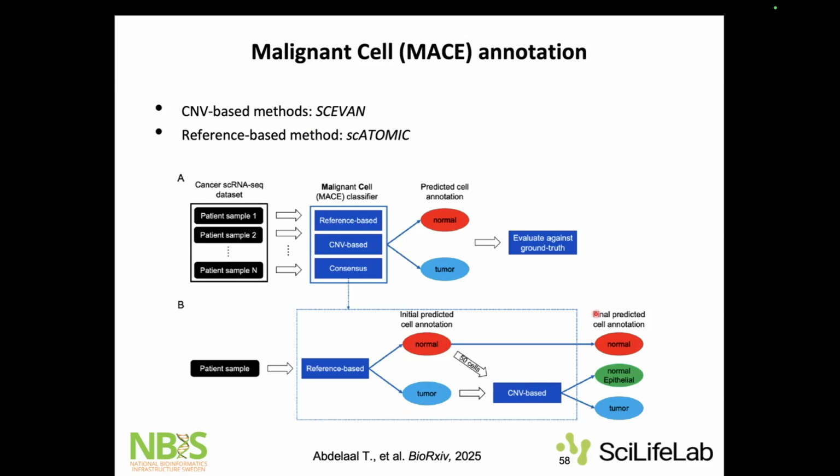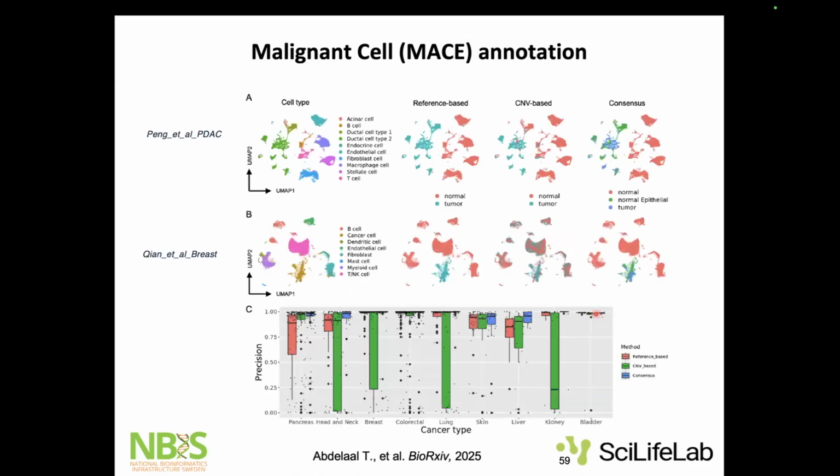So maybe that is one way to solve the issue for cancer data. We don't know yet. We need to really evaluate it ourselves. But it would be good to keep in mind that most of these methods, if you only use reference-based methods and group cells based on them, are not performing very well on cancer data sets. So just keep that in mind.